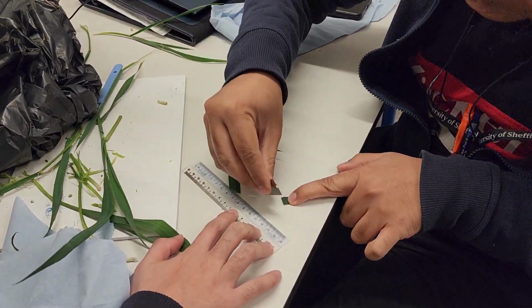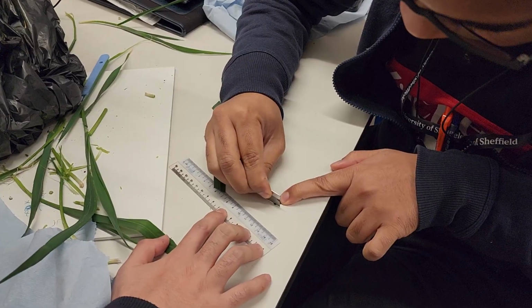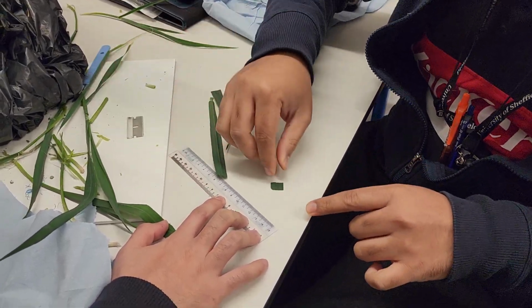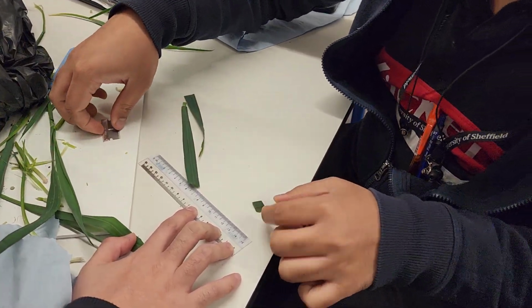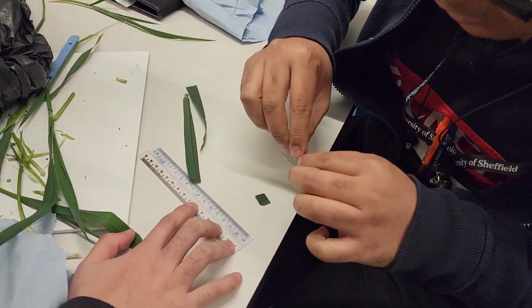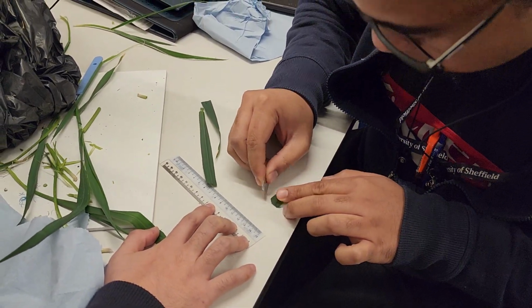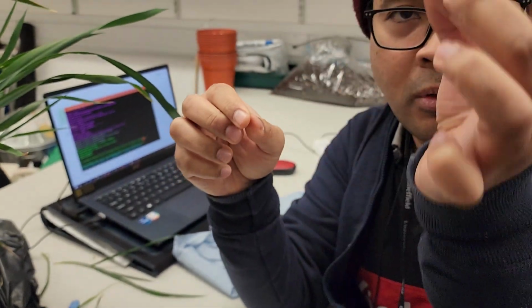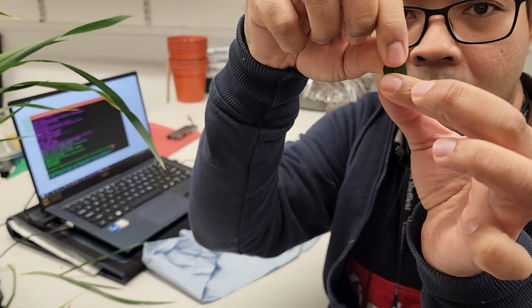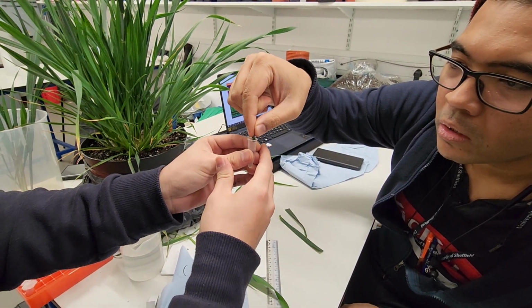So the top, we mark with the edge. We earmark, dog-ear your leaf. Maybe you can do both, just to be certain. Ta-da! So that's the top, the one that looks like a trapezium, and the flat bottom is your base.